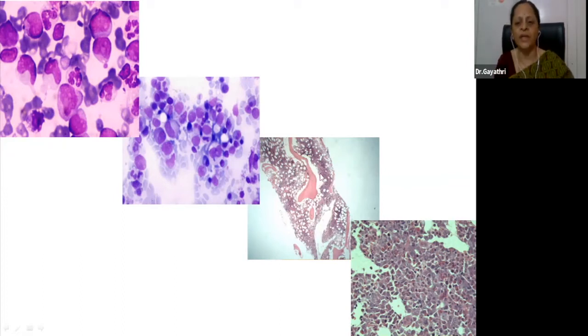They are abnormal WBCs. This is the higher magnification H&E stain of the trephine biopsy core. You must remember that these are cells, monomorphic again, with large vesicular nuclei. Describing the shape of cells in the marrow makes no sense. All the cells in the marrow are round. So these large cells with vesicular nuclei, monomorphic, they are blasts.